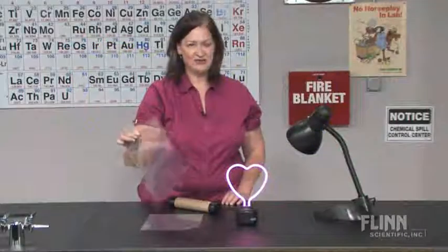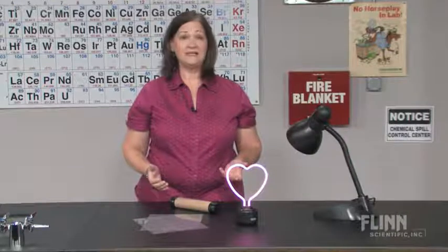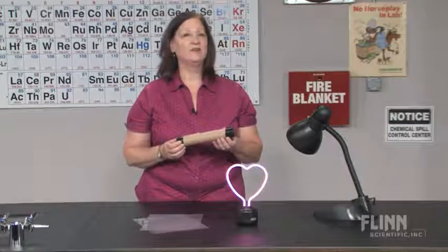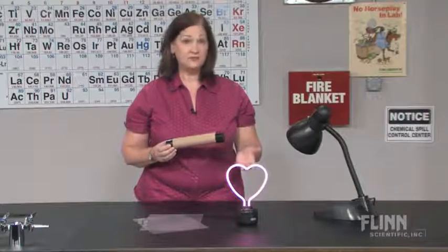Looking for activities to integrate STEM design into your curriculum? The Flynn Build a Spectroscope Kit is perfect. Spectroscopes are great for seeing the spectrum of colors from visible light. But when students build a spectroscope, they discover not only why white light is separated, but also why different light sources produce different kinds of spectra.